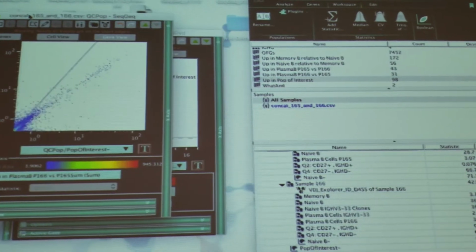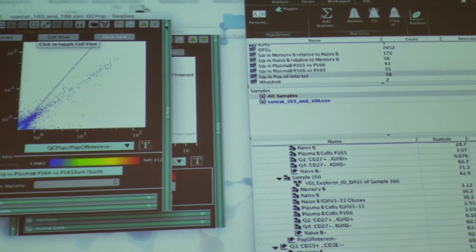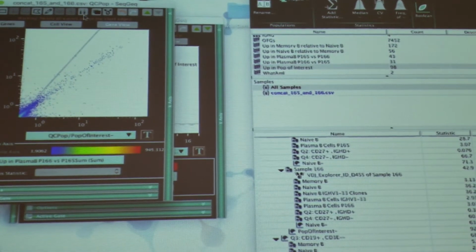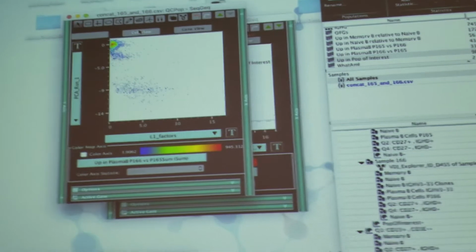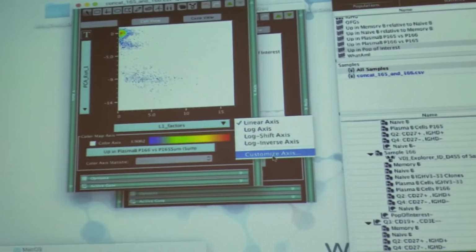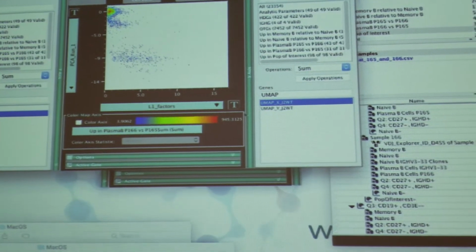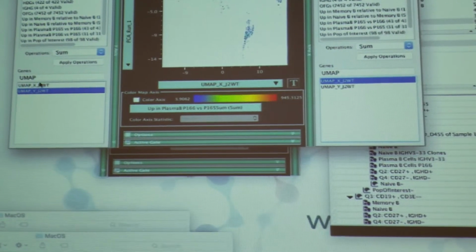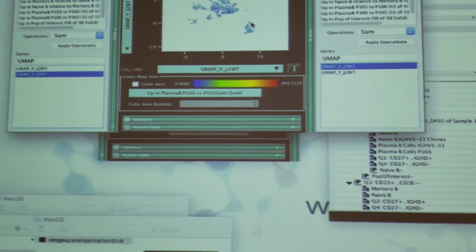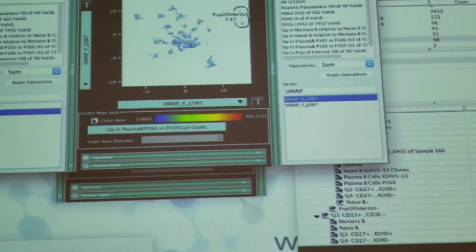Can you look at another one that's sort of high by some criteria? Go back to get a population that's not such an outlier. I mean, maybe slightly outlying, but not too much. Where we have to make a hypothesis that cytotoxic B cells are autoreactive. Like Benga's about to do. You know, we'll get around to that, Benga, don't worry. We'll keep it in mind.